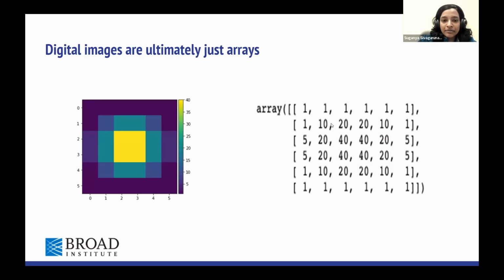This is something so similar in microscopy image as well, because each pixel in your microscopy image contains some values. If it is a fluorescence image, each of it would contain values about the intensity of your fluorescence, and so forth. So if you're having an image of 1000 by 1000 pixels, then each of the pixel would have some information or numbers associated with that. If this is the case of just one single plane image. If you're having multiple Z planes, like a 3D, three-dimensional volume image, or if you're having a time-lapse movie, you can imagine how much data you get from a single microscopy image from your experiment.